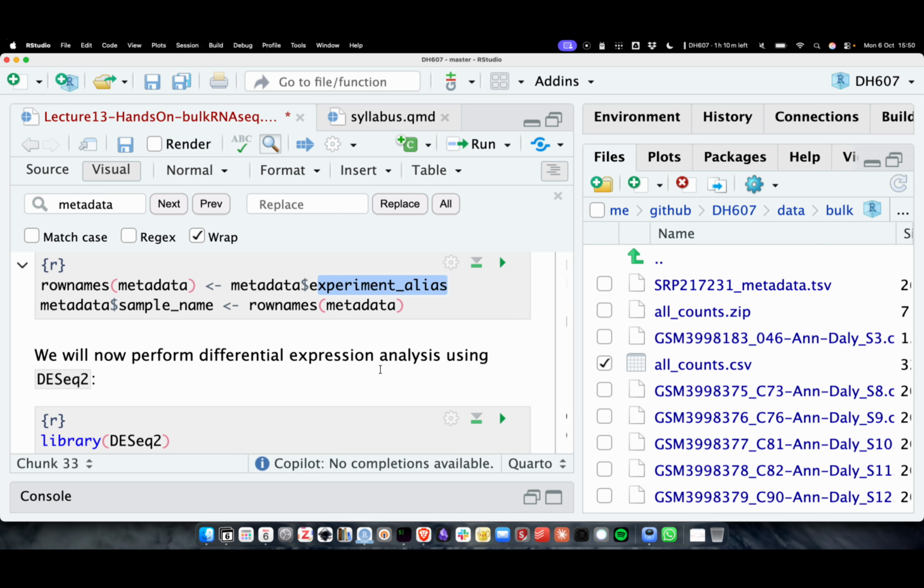Then what do you store in metadata? It's a very free flowing thing, right? So it could be stage of the disease. It could be a date when the sample was taken. It could be age. Any other factor that you think of, right? Sex, gender, any other thing that you can think about that will vary across these different samples. Usually it will have the sex of the sample and usually not gender. But these are things that you would ideally have in most cases.